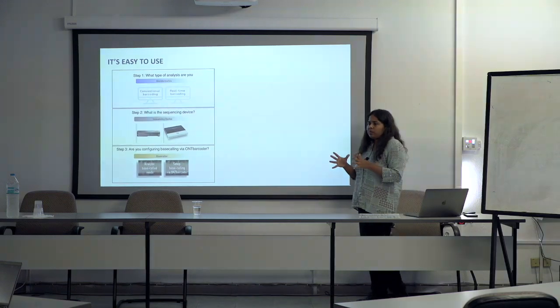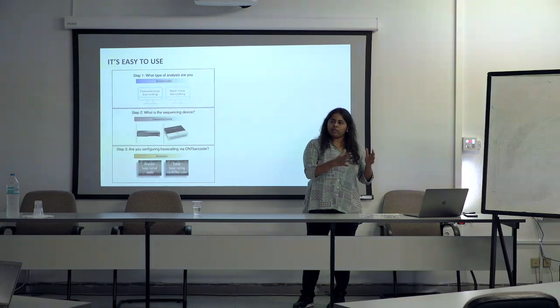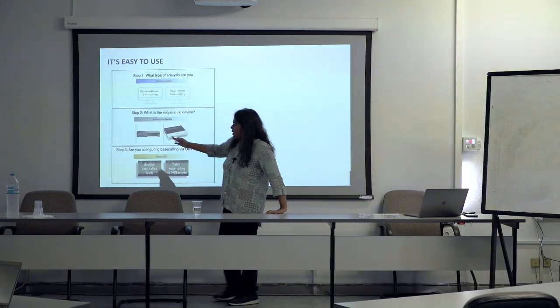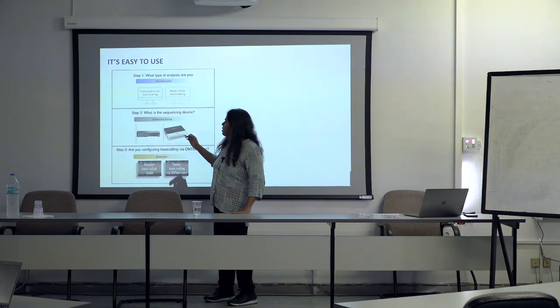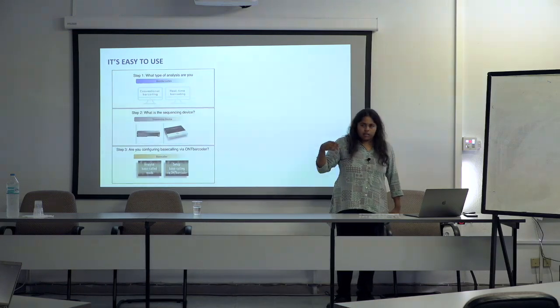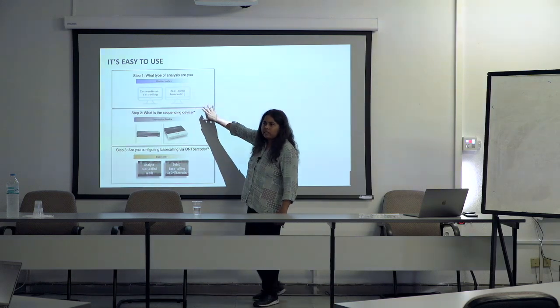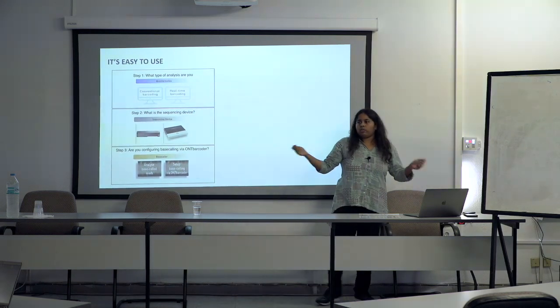So you might have a GPU computer separate. You might want to base call differently in a different computer. You might want to sequence in a different computer. If you're sequencing in a device like Natasha's yesterday, then you can just base call at the same time as you are sequencing in the same device. So you can operate this software anywhere really. You can do it on the same laptop, or a different laptop, and connect it over Ethernet.